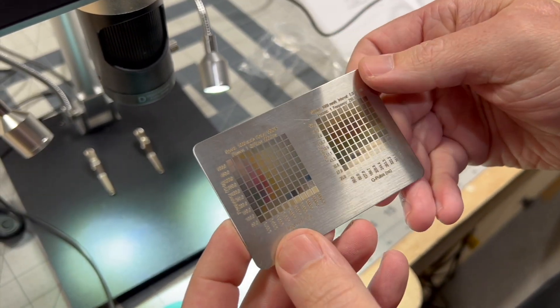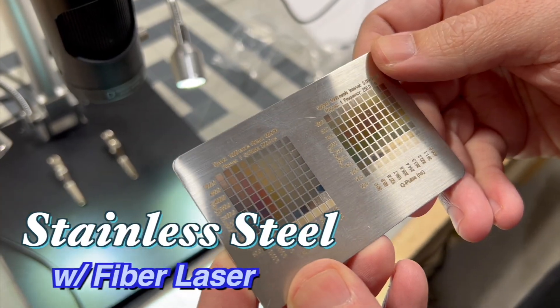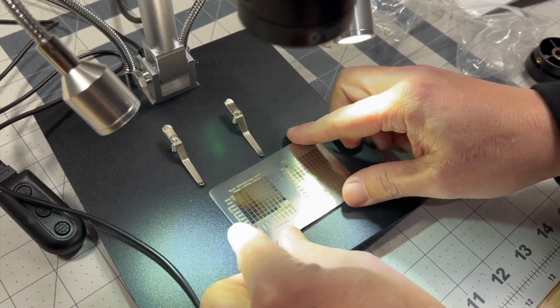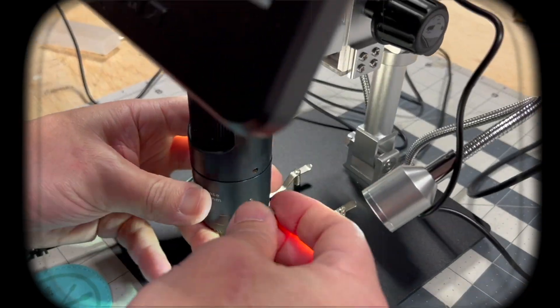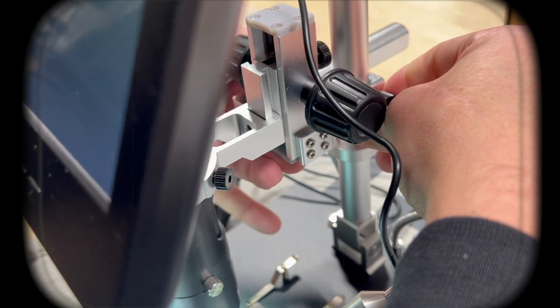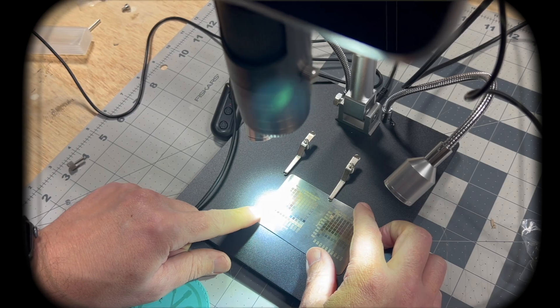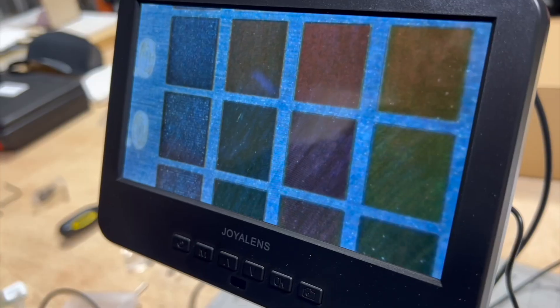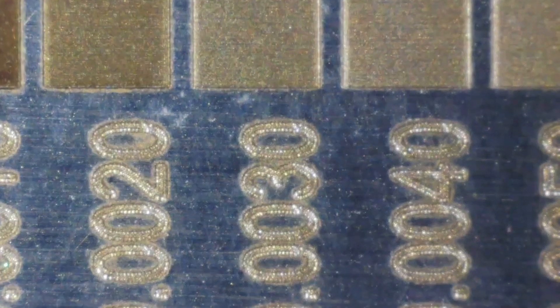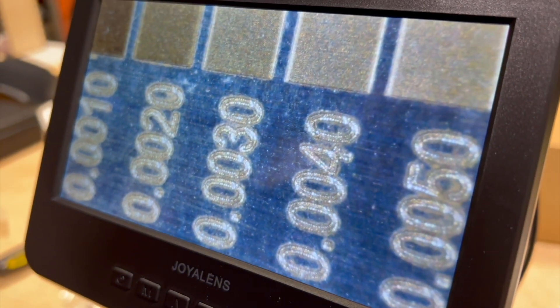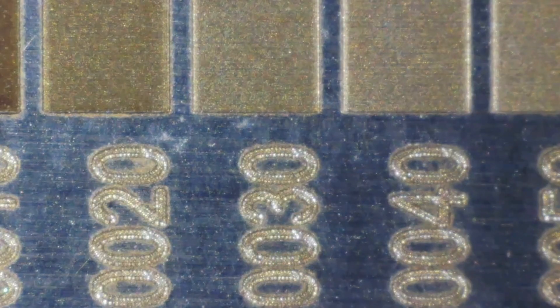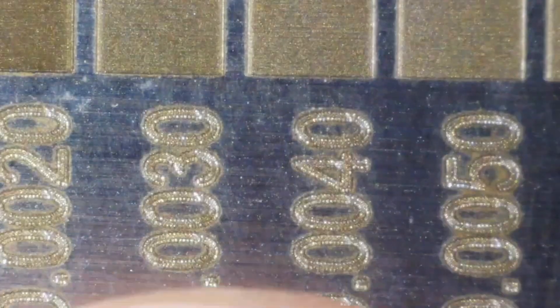All right, so the first thing I want to look at is this color test we did on stainless steel because I thought that'd be kind of neat to look at up close. So let's see what it kind of looks like. So obviously this is pretty cool and we can look at the colors that it put on there, but we can't really see a whole lot of details. I guess right there on the letters you can see some details. This was made with our fiber laser so that makes extremely close cuts there.